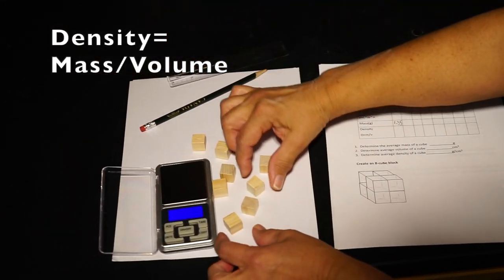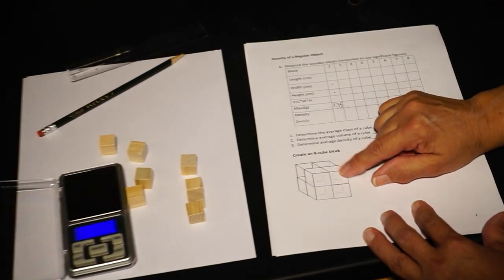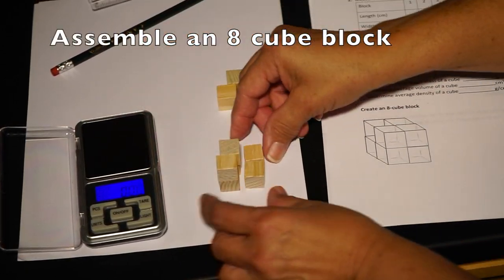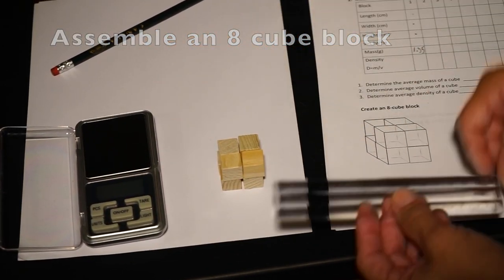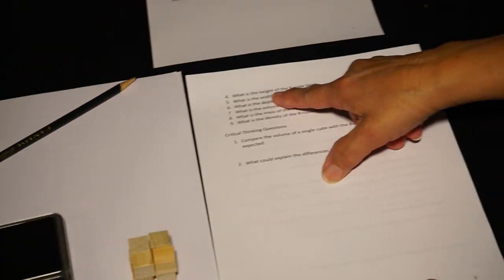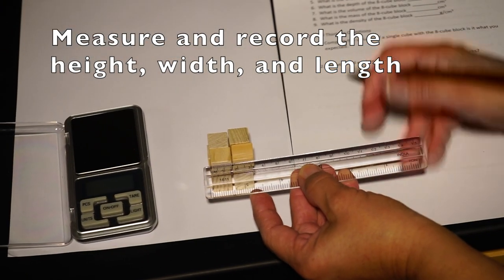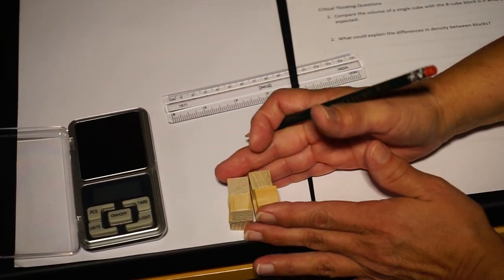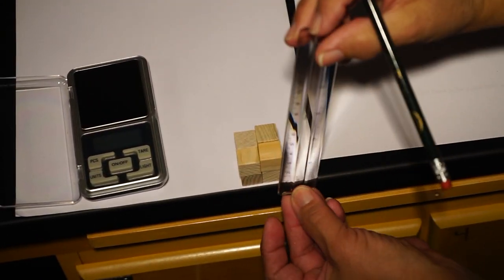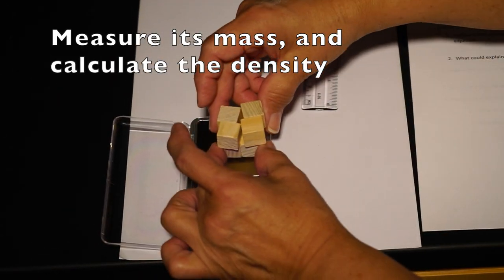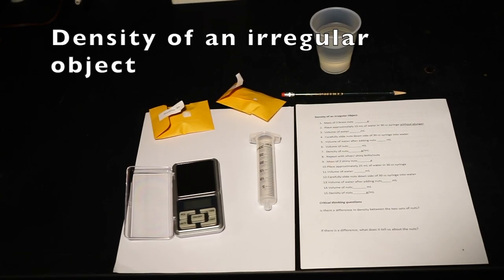Then calculate the density. To do this, divide the mass of the block by the volume. Again, do this for all eight blocks. Next, assemble all the blocks into a single block. Measure the height, width, and length of this eight-cube block. Determine the mass of the block by placing it on the balance, then calculate its density.